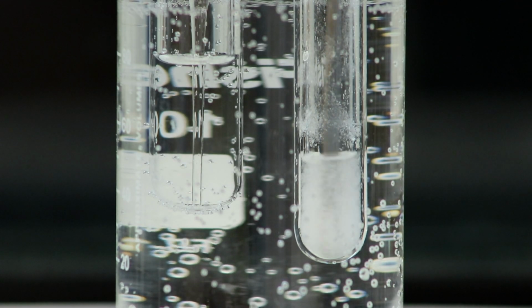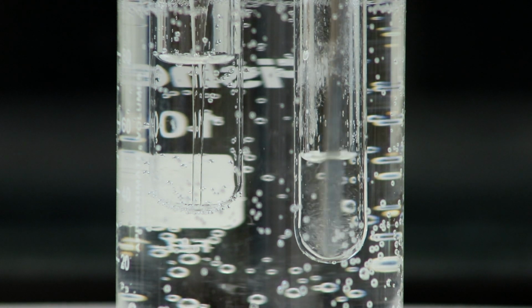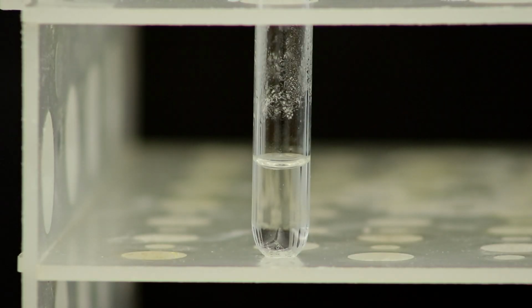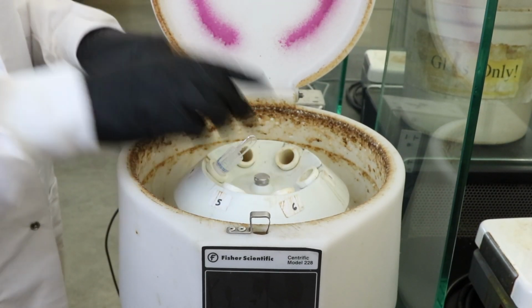Then I'll put it back into the hot water bath to redissolve the product. And finally leave it on a rack so that the product can recrystallize slowly at room temperature. I'll use a stopper and a polypropylene test tube to separate the crystals from the solvent, and I'll run it in the centrifuge for a couple of minutes.